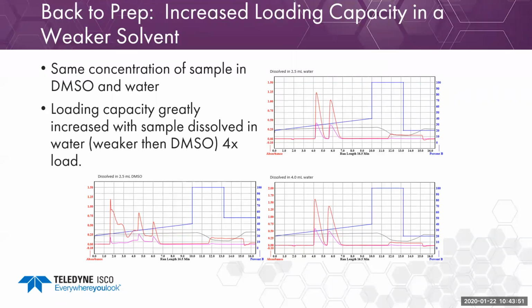Keep in mind, these are obviously compounds that we're able to dissolve in both water and DMSO, but it illustrates the effect that we can have by trying to move to a weaker solvent.